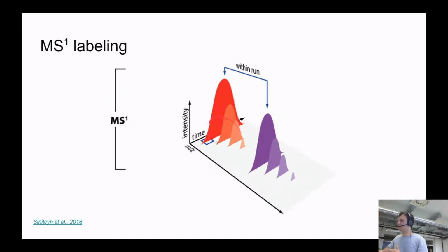So this is light peptide with light arginine and lysine, and this with heavy arginine and lysine. As you see, column chromatography cannot distinguish one from another. Who can distinguish is just the mass analyzer. And we see a situation like that all the time. And what's really cool now, we can compare intensities of the light channel and heavy channel.